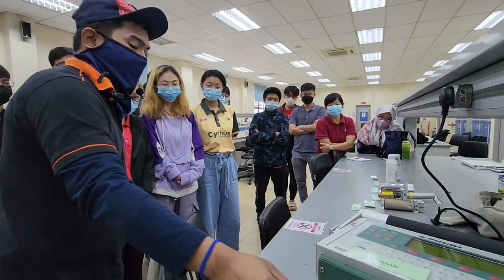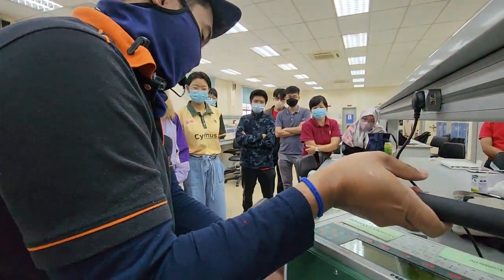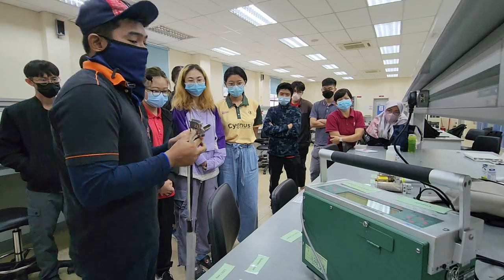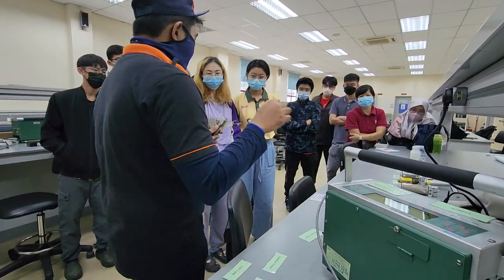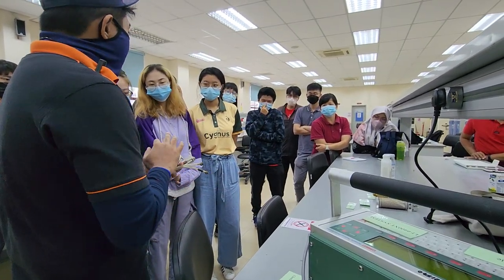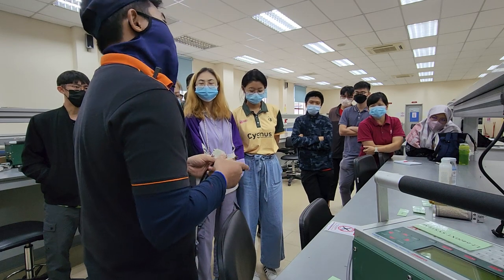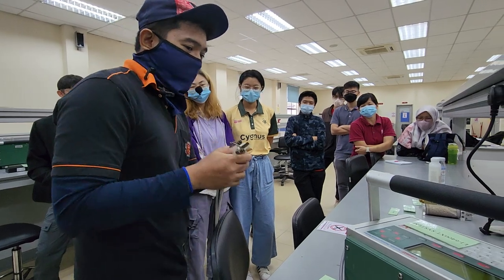So we're done with this side. The other side is meant for the connection of the cable. If you're not familiar with the cable, remember cables like this, like your VGA cable. You have the male and female parts. It always goes the opposite, male to female, not male to male. Nothing is going to happen otherwise, no rainbow flags coming flying towards you.